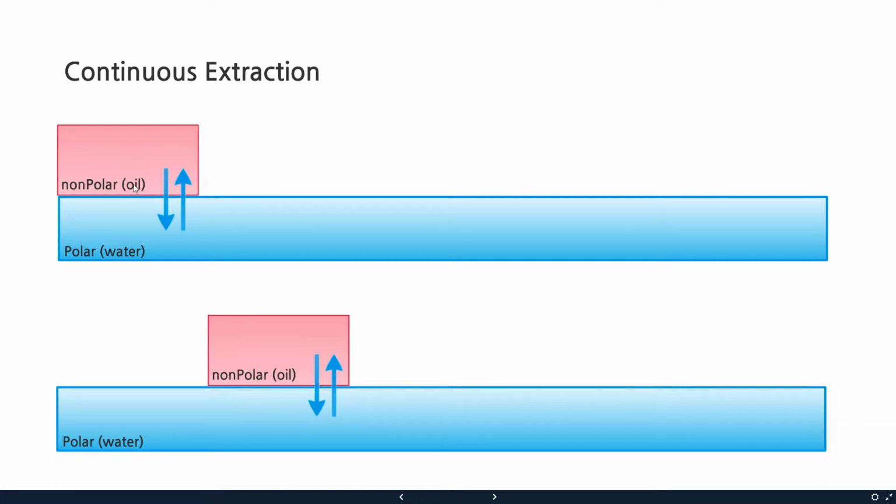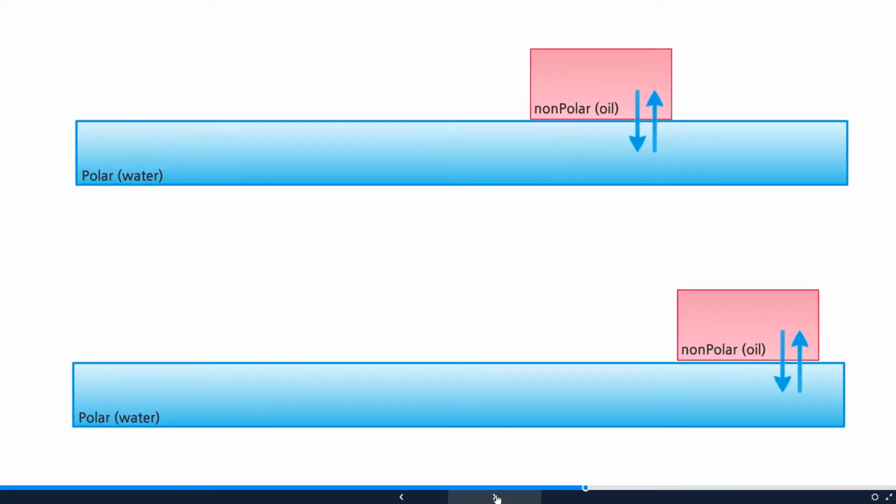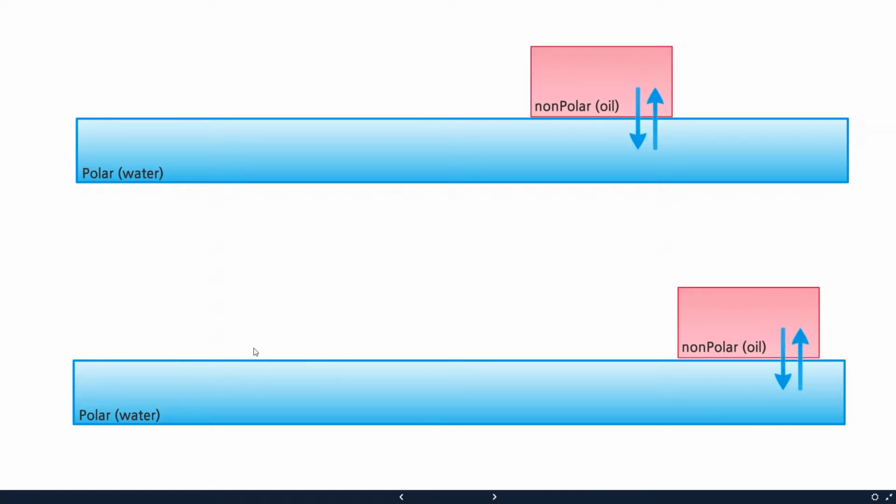What we're going to do is generically use a term that is used in chromatography, and that is the affinity, or the friendliness, or the likelihood that an individual component will leave the stationary phase, dissolve into the mobile phase, and then, since the mobile phase is moving, move down the column. So as our cartoon was presented inside class, the samples eventually find themselves riding the bus, if you will, or riding this mobile phase.